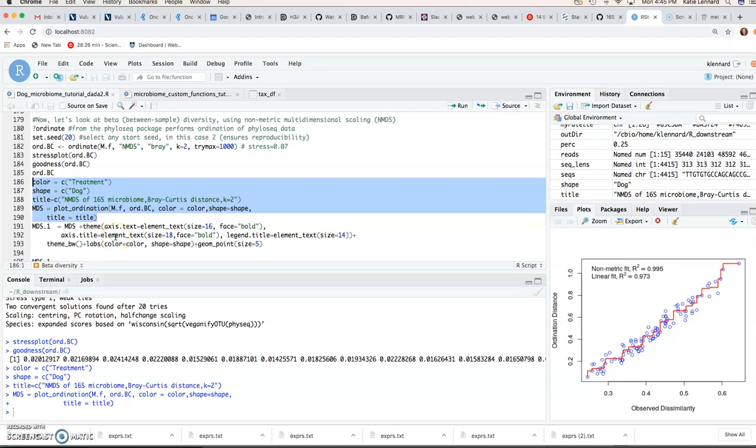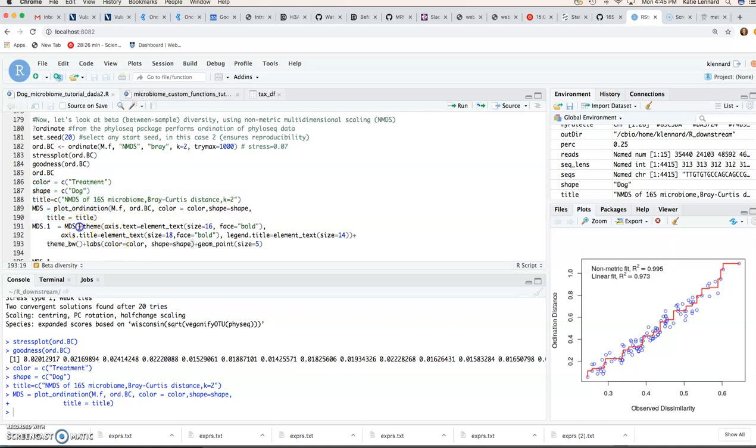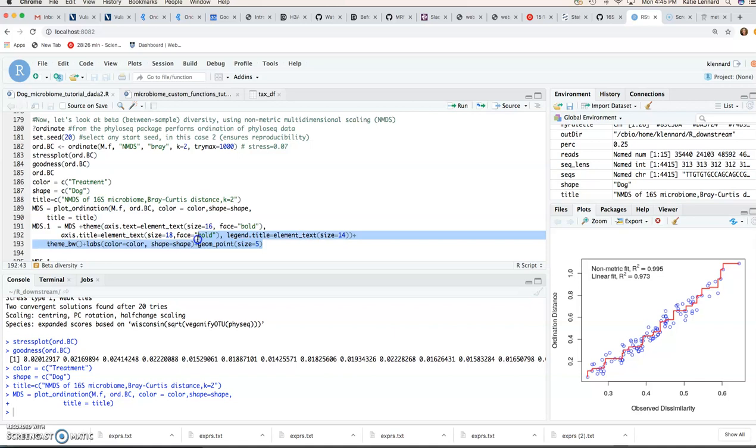And then again, this is a ggplot function. So you can see you add the different ggplot layers here. You can select your font size, whether it's bold or not, even your legend size. So you guys can play around with this just to familiarize yourself with ggplot functionality. Because that is really the most commonly used plotting function in R now. And it's also the most customizable.